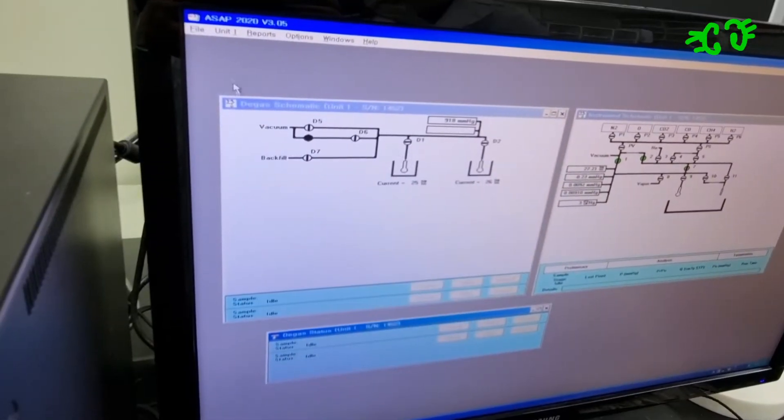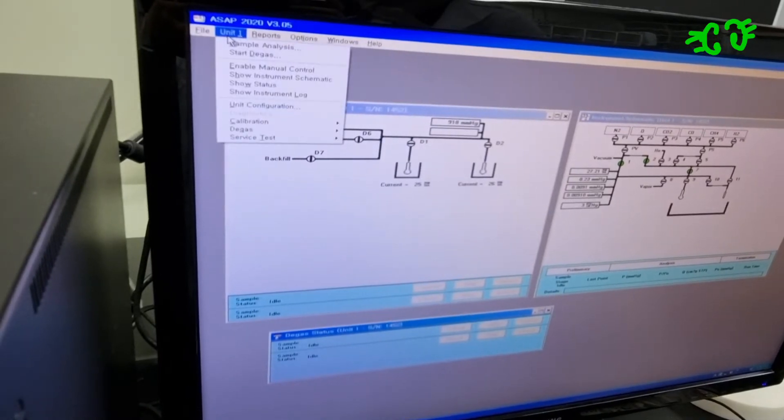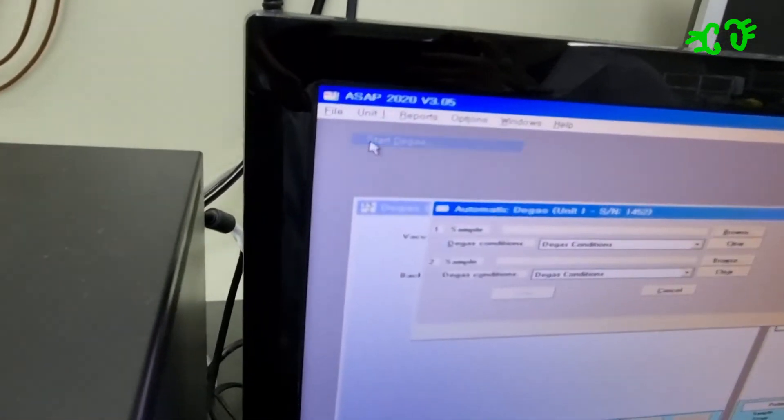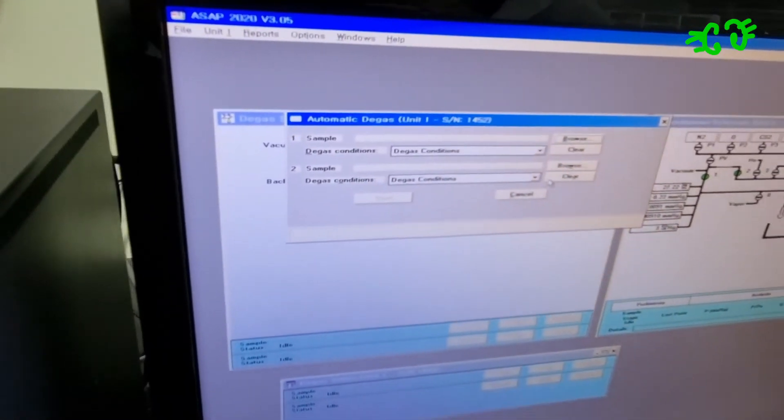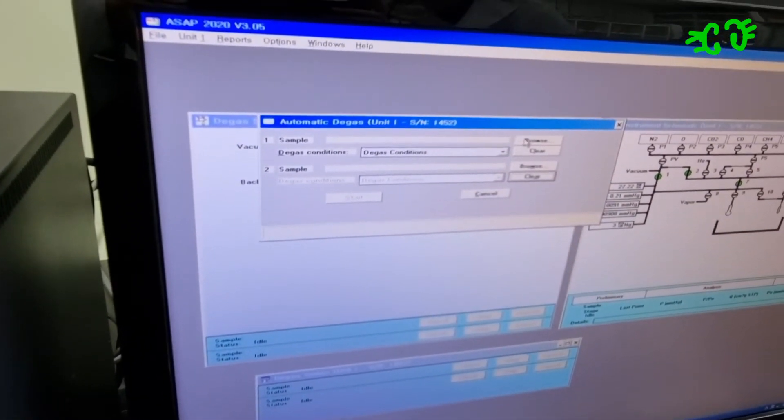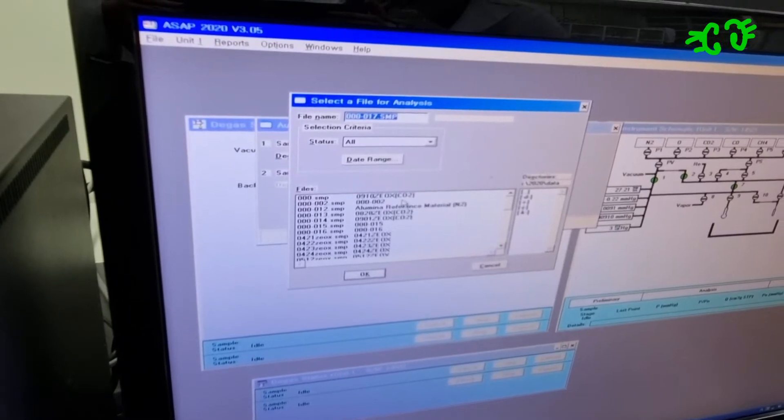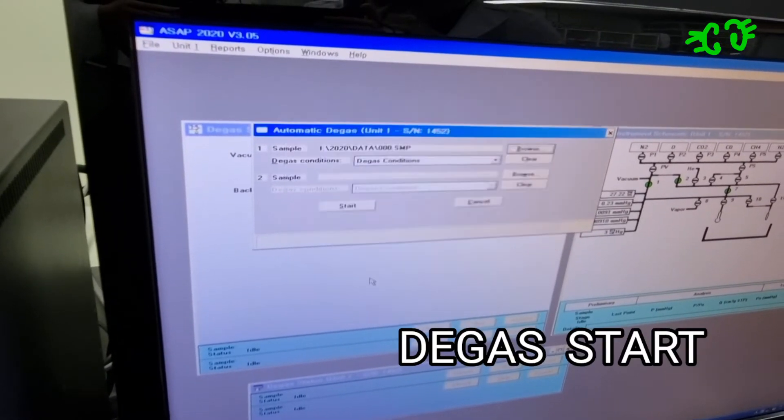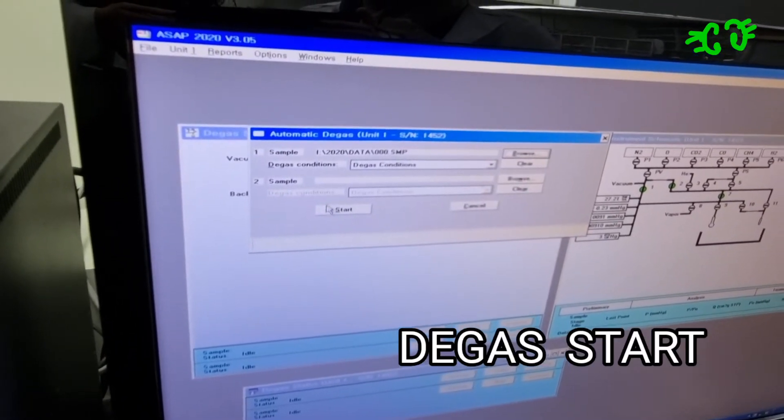To start the degassing, you should go into unit 1, start degass. Here we should clear the port you are not using and click browse to select what you are going to degas. Then you should click start.